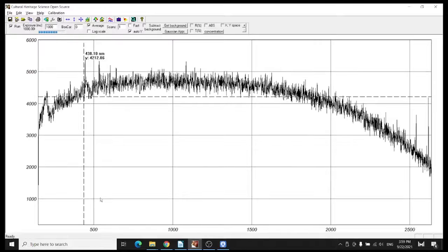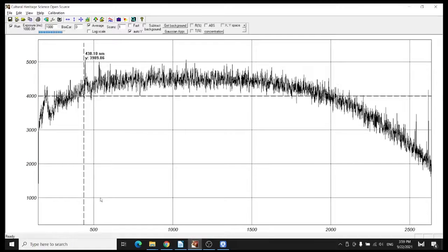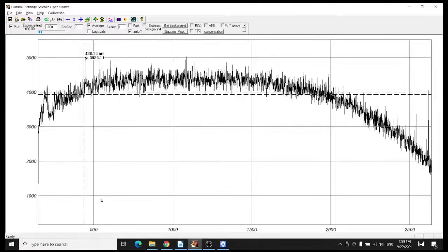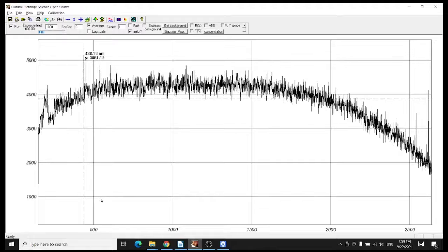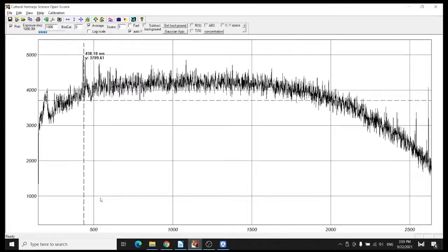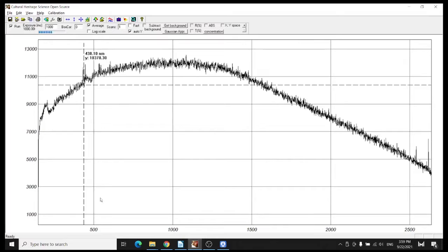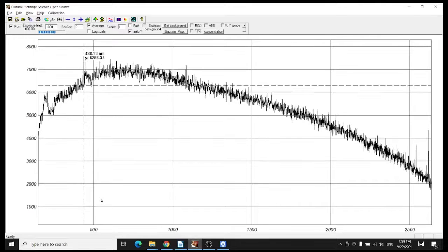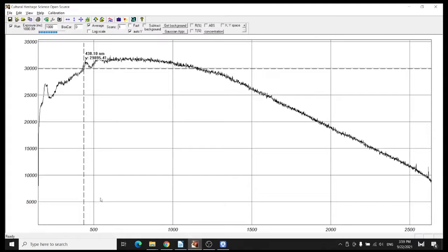When you do Raman spectroscopy, it makes sense to move the object a little bit out of focus in order to have more of the sample. So I'm moving by free hand a tiny bit. You see now, and we can check where we can get a better signal.